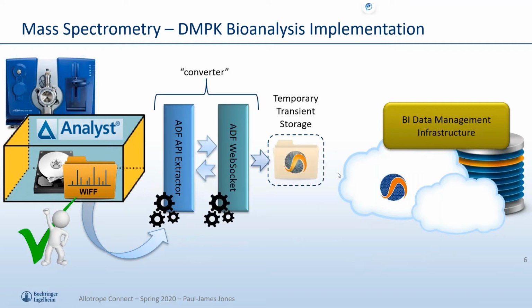In this scenario, it's not actually all that different from what Henning presented. On the left, you have the instrument and the associated software, in this case, Analyst. The important piece of it is, at least in our implementation, it will be a manually triggered process.